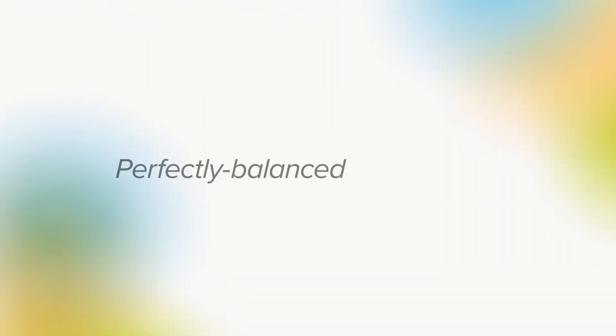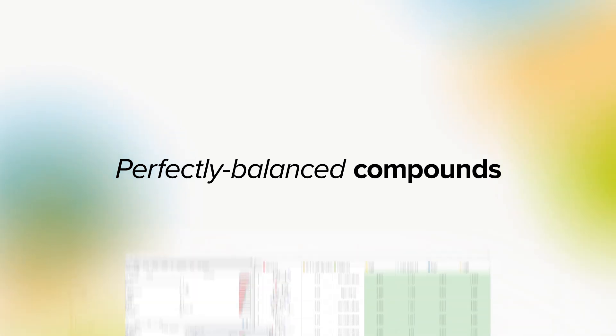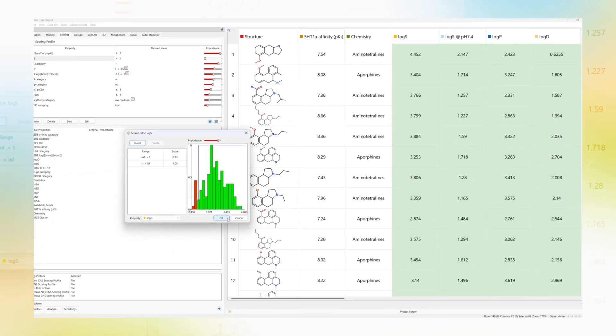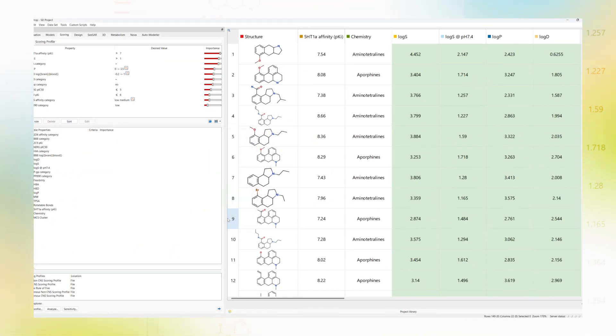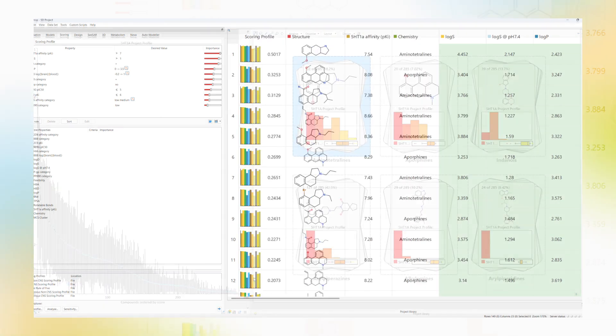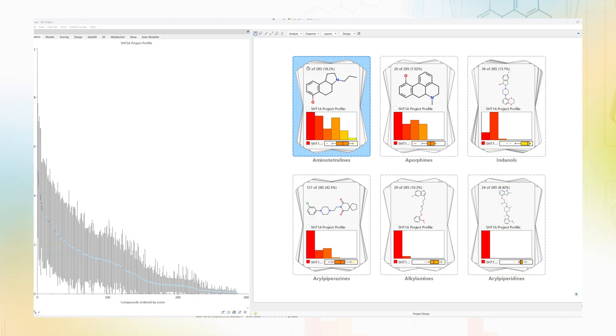You can also pick out perfectly balanced compounds with our unique probabilistic scoring approach to multi-parameter optimization. By setting a desired profile of properties, you can assess compounds for their likelihood of success in your projects.